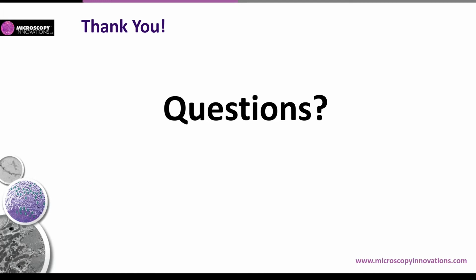No, that's pretty much it. I think also being able to go right to the next step when the step you're on is done. When the human's doing it, the timer goes off and you might be busy and you're not there at exactly the optimized time to go to the next step. Right, yeah. Also that. But okay, thank you.